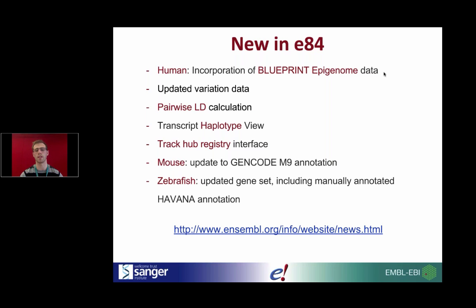We also have a large amount of updated variation data. And moving on to variation, you're now able to calculate linkage disequilibrium in a pairwise manner between 2 variants of interest. You can also view the transcript haplotype view, which is a way to analyze 1000 Genomes variants in a transcript dependent way.